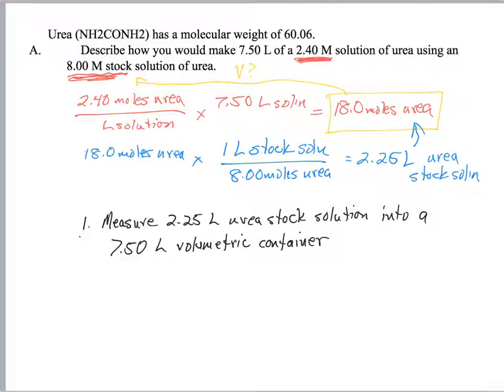Remember, a volumetric container is either a graduated cylinder or a volumetric flask. And now our solute is already dissolved in that.